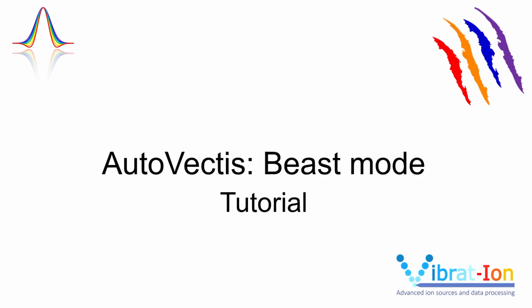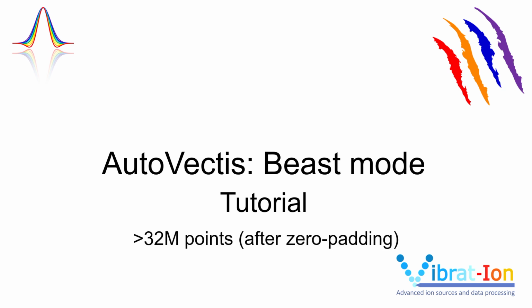Hi there, in this video I'm going to show you how to use Beast Mode in AutoVectis. Beast Mode has been developed to help you process FTMS data with large transients. So here we're talking about transients that will be larger than 32 million points long after however many zero pads you're applying.